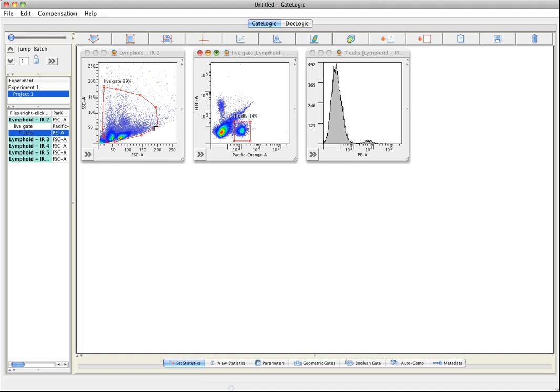I have already preset the gates. We have one here, a live gate, and we have a T-cell gate here on our sample number 1.